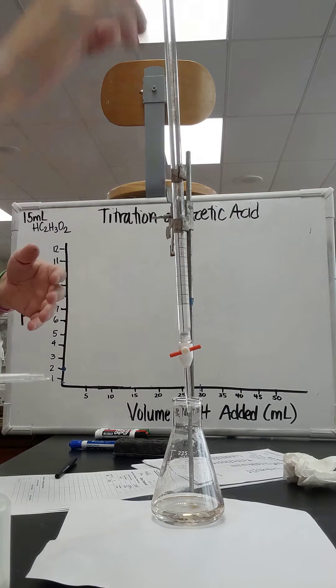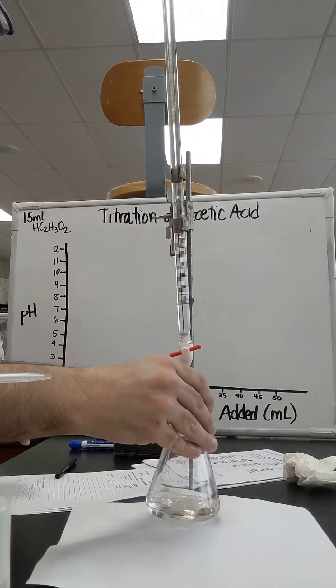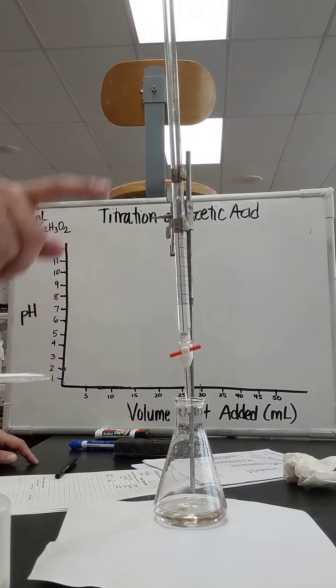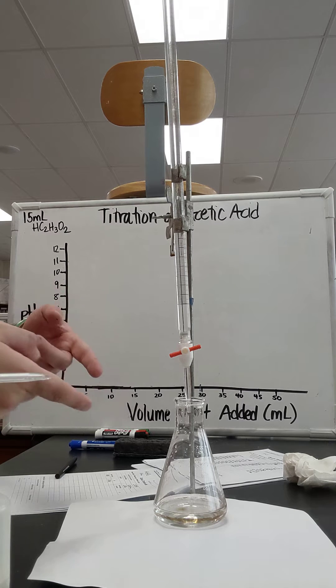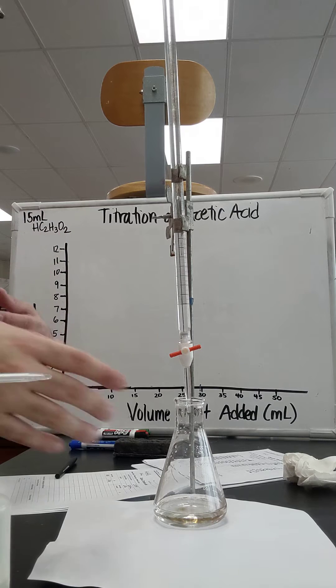So in my burette, I actually have it up to the zero mark to make my measurements easier. I have 2 molar sodium hydroxide. I took the initial pH of the acetic acid and it was 2, a lot higher than the initial pH reading of hydrochloric acid, which means that this is definitely a weaker acid. Higher pH means less acidic, more basic.